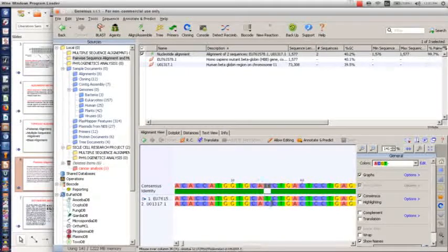Now for you to understand an issue, or to understand if a problem has arisen, or maybe you need to study a particular thing when it comes to mutation analysis in pairwise sequence alignment, it is the graph that will tell you. Normally you may not know if an issue occurs between two sequences after the alignment. But to understand if there's any issue, you look directly at the graph and the consensus sequence.